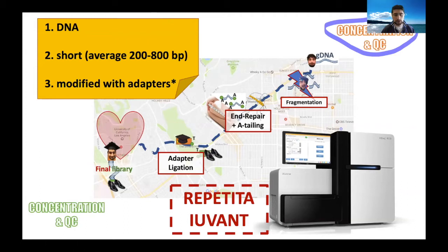The ratios 260/280 indicate the presence of protein or RNA contaminants, or 260/230 for the presence of organics, such as phenol, carbohydrates, and so on and so forth. So the nanodrop is only for measuring the quality; the concentration we usually perform with the Qubit.